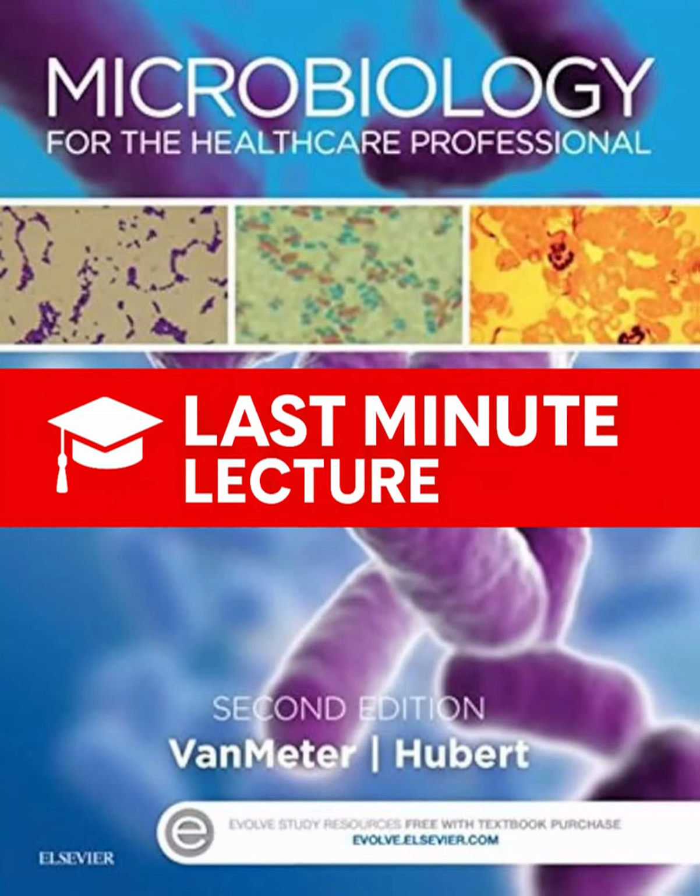The main way is the streak plate, right? That's the classic, the streak plate. You take your sample on a loop, and you basically spread it back and forth across one section of the agar plate. Then you sterilize the loop, cool it, touch it to that first section, and drag it into a second clean section. You repeat that maybe 3 or 4 times, streaking from the previous section into a new one. Each time you're dragging fewer and fewer bacteria. By the last section, you should have individual cells spaced far enough apart to form those nice isolated colonies.